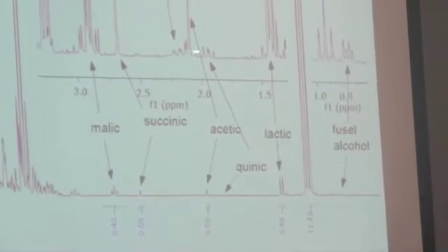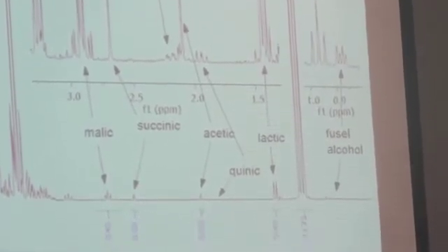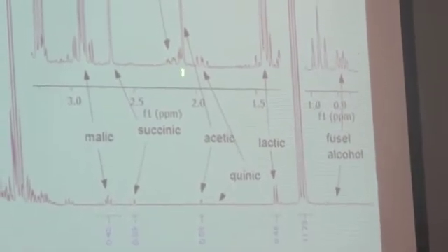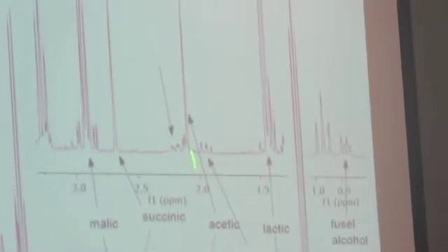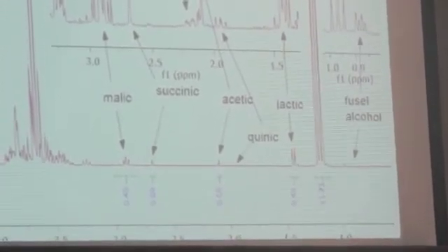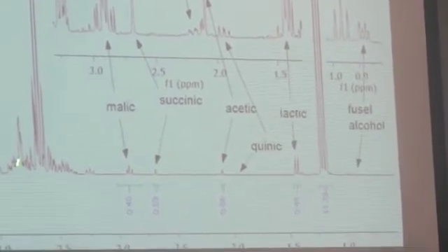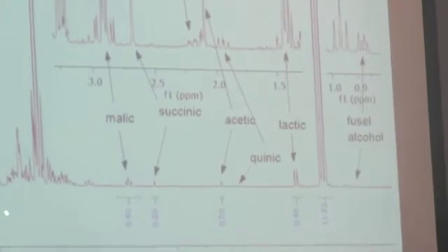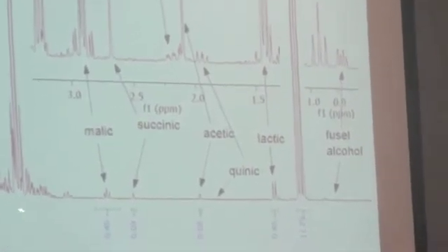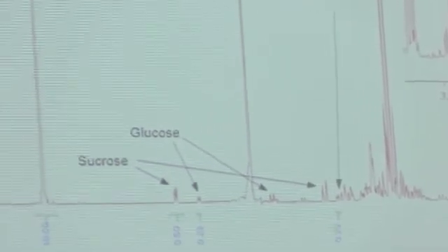You see this kind of thing in cranberries. There's a lot in cranberry, and I think it's what makes it make you pucker a little bit. This peak going out of here is acetic acid. You have succinic acid, which is another molecule that's part of that glucose to ethanol process. And down in here, there's a couple of peaks that are from fructose. There's some peaks here that are from glucose. This peak is from sucrose.